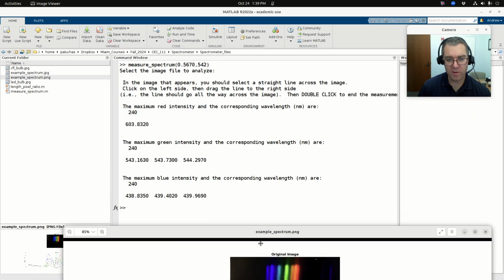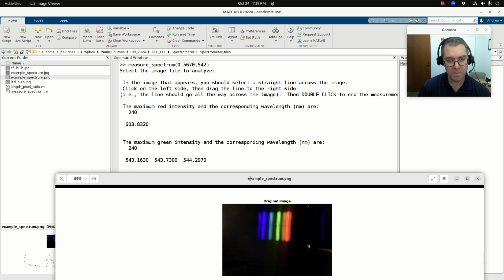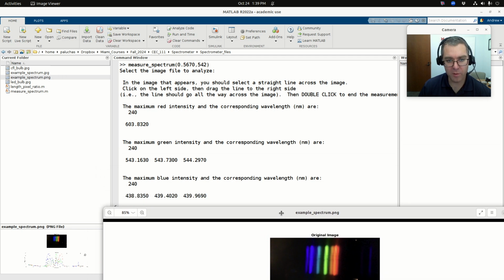You'll notice for the others we get multiples, and we can come back to that. So green, here's my maximum intensity, 240, and that's where it's occurring. And remember, these are kind of discrete state points. And so it might be I have some small oscillation within this image, which I can't quite make out with my eye. Okay, and then there's my blue max intensity as well.